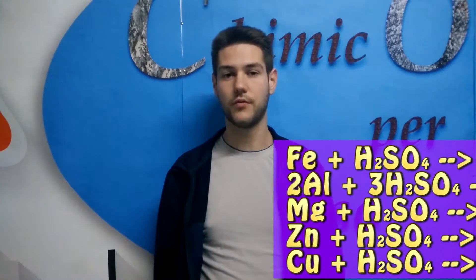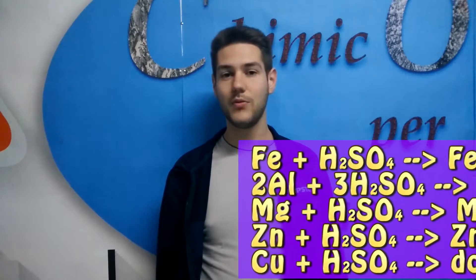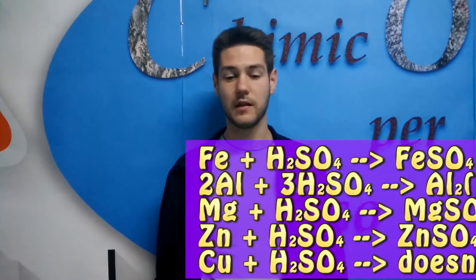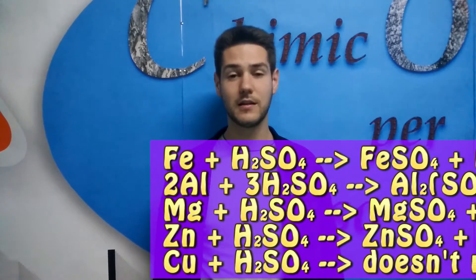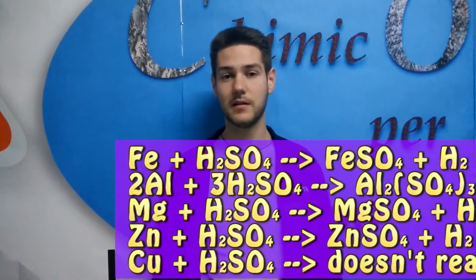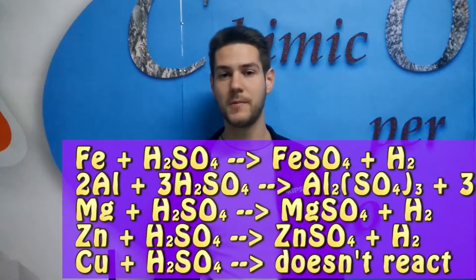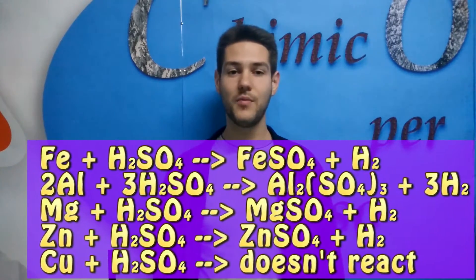The reactions that happened in this experiment are between sulfuric acid and metals. These types of reactions are very exothermic and they produce pretty dangerous gases, so we must do them outside. These reactions produce a salt that is soluble in water. When we put the metals simply into the acid without diluting it even a little bit, we see that they don't react a lot — only magnesium does.